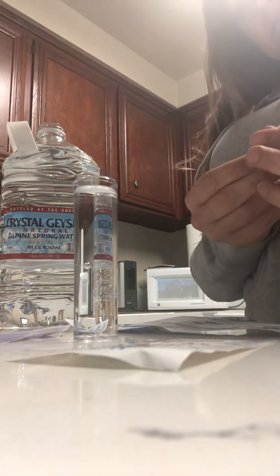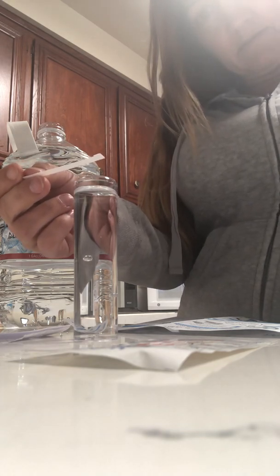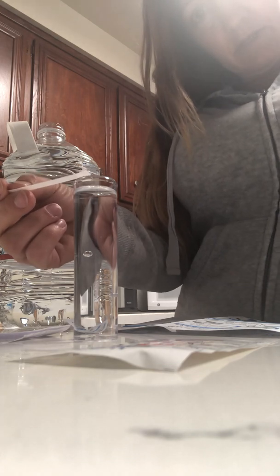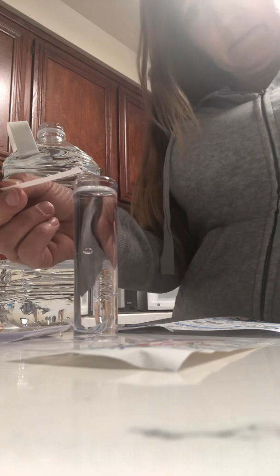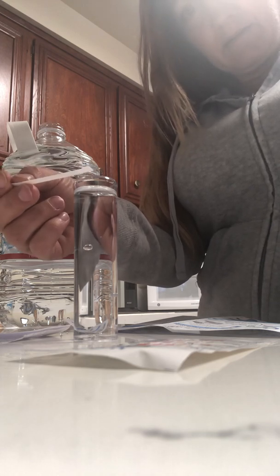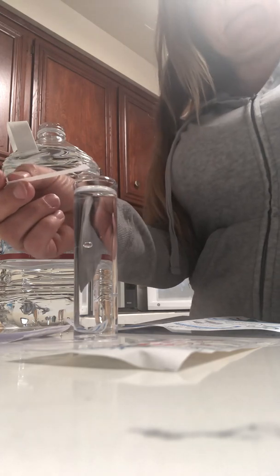One one thousand, two one thousand. Now wait 60 seconds — 2, 3, 4, 5, 6, 7, 8, 9, 10, 11, 12, 13, 14, 15, 16, 17, 18, 19, 20, 21, 22, 23, 24, 25, 26, 27, 28, 29, 30... 41, 42, 43, 44, 45, 46, 47, 48, 49, 50, 51, 52, 53, 54, 55, 56, 57, 58, 59, 60.